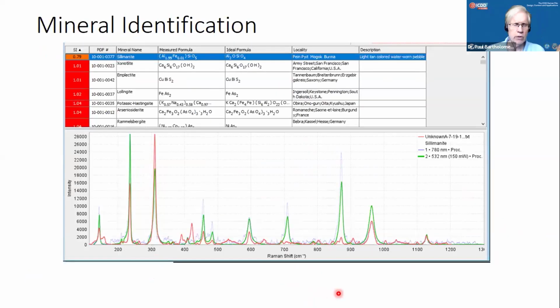And a quick look at what the result looks like. You've got some matching program. It runs some similarity index, shows you the results in order of highest similarity to lowest. We're actually going to look at this example later on. I'll come back to it.